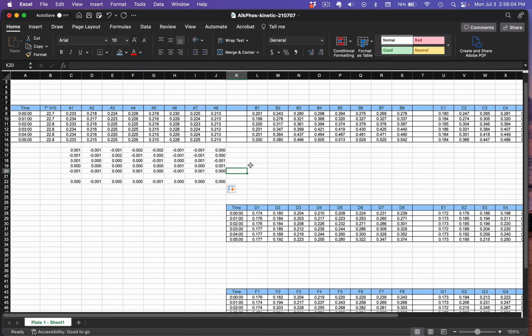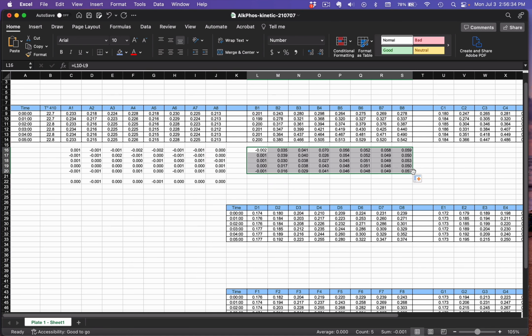around. So now we're essentially going to do the same thing we just did here on all these other rows. I'm going to copy this and paste it right there. And this is telling us, once again, B1 is simply looking at hydrolysis of substrate or any sort of activity with no substrate present. So we expect that the absorbance there should be pretty much nothing, no change in absorbance. And then we're increasing substrate as we go across. Then we're going to copy this and paste that there, and do the same thing there.